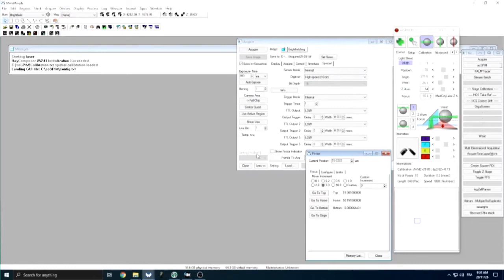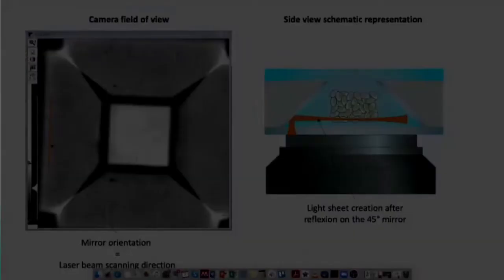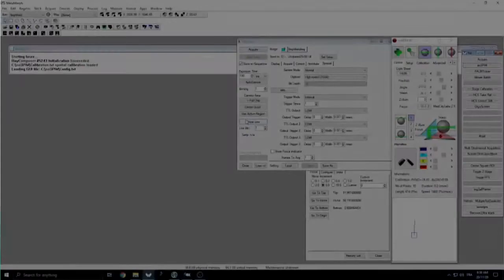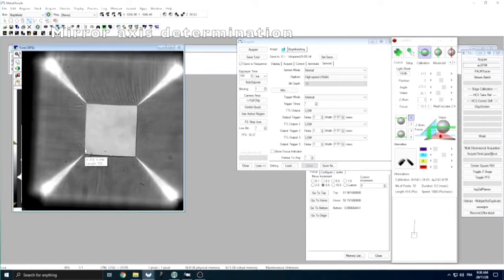We then open the SOSPIN software, the Metamorph acquisition window, and the control window of our Z piezo stage. We adjust the focus of our objective onto the device using a brightfield illumination mode, where we can see the shape of our pyramidal wells and adjust the focalization either at the bottom or at the top of our G-wells. A first and mandatory step is to tell the software the orientation of the mirror so that it knows how to scan the laser to create the light sheet after reflection on the mirror and how to displace the light sheet in depth for 3D imaging. To do so, we typically focalize our image plane on top of our mirror and simply draw a line that follows the orientation of the mirror.